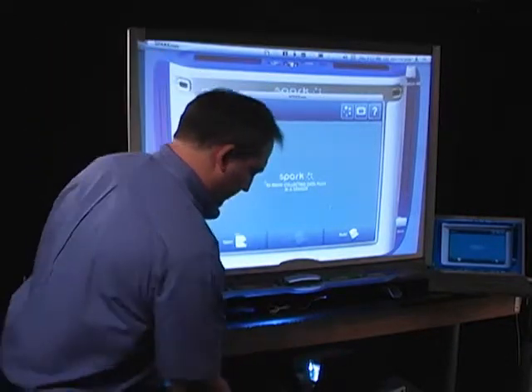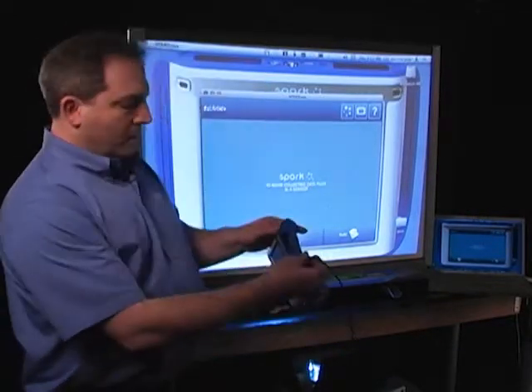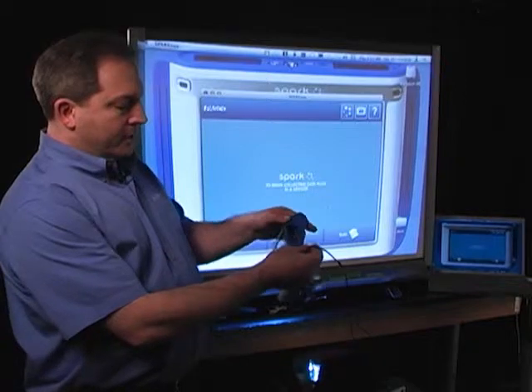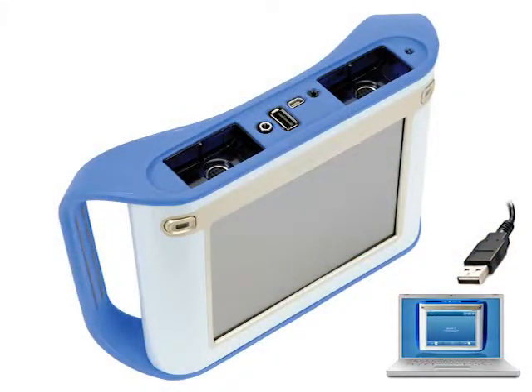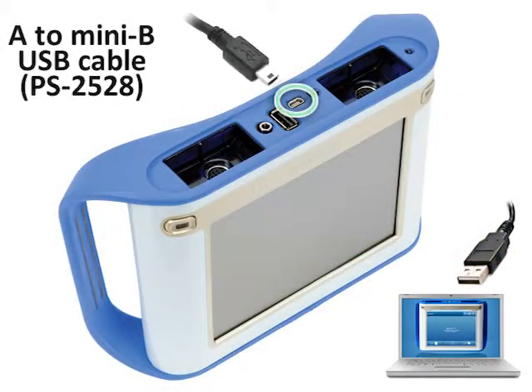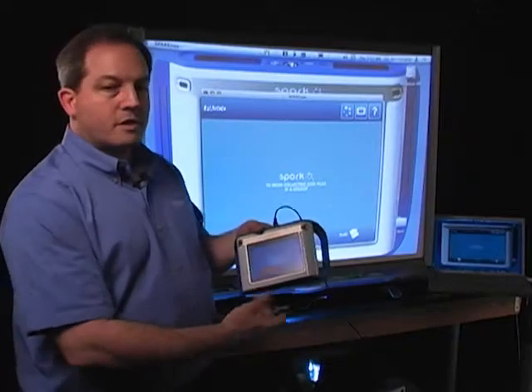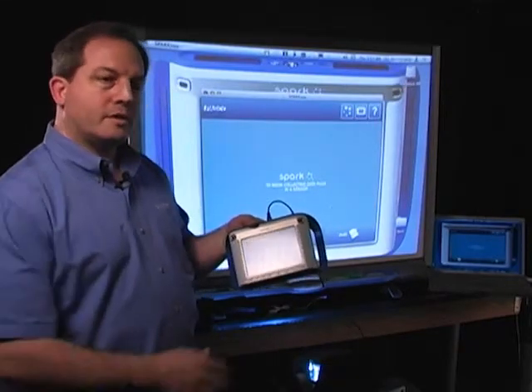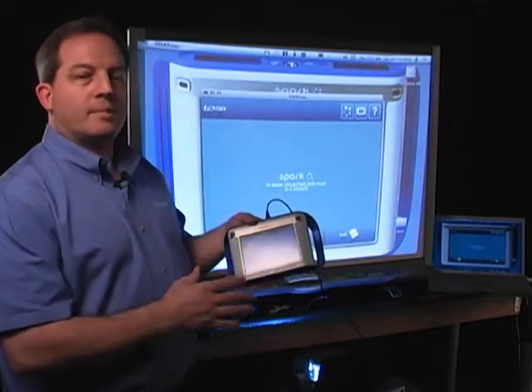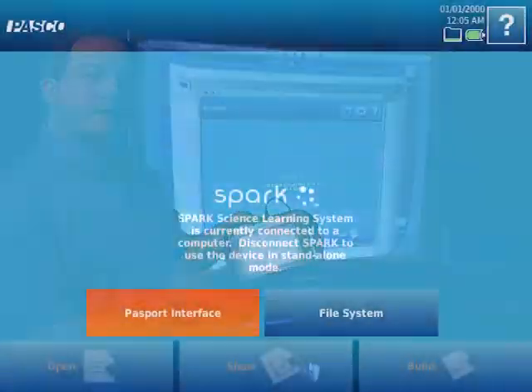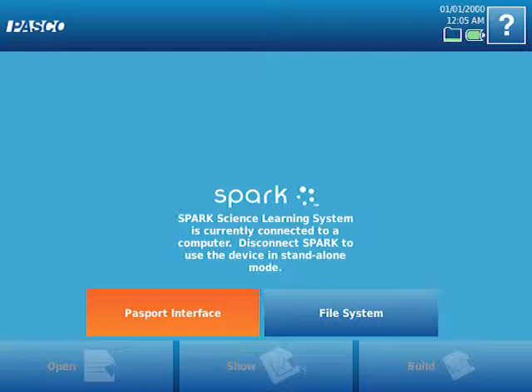So let's go ahead and do that. I'm going to connect it to the port at the top of my Spark Science Learning System. And with the latest version of software, what you'll notice is that two options come up: the Passport Interface option or the File System option. By default, it comes to the Passport option, so that is exactly what we want.